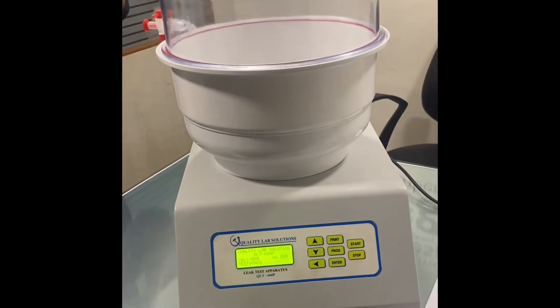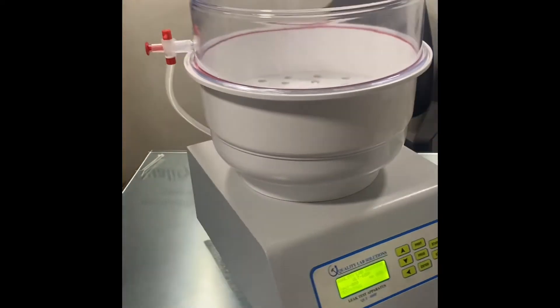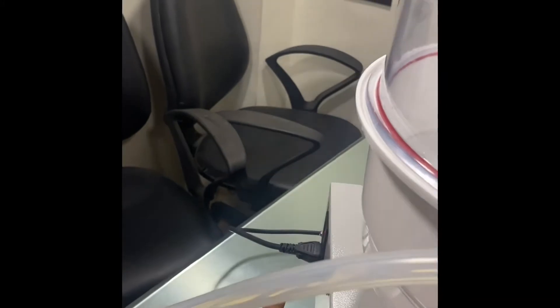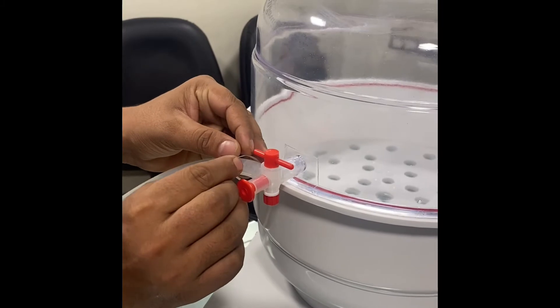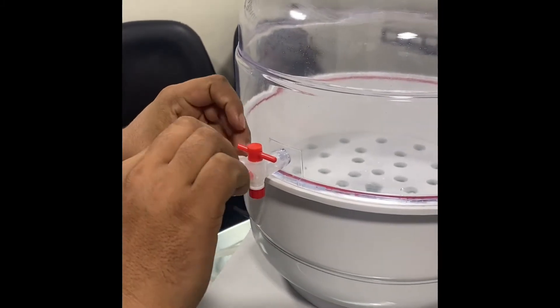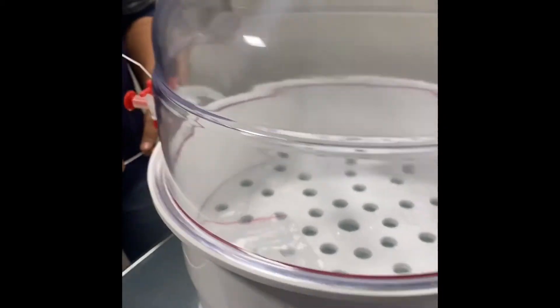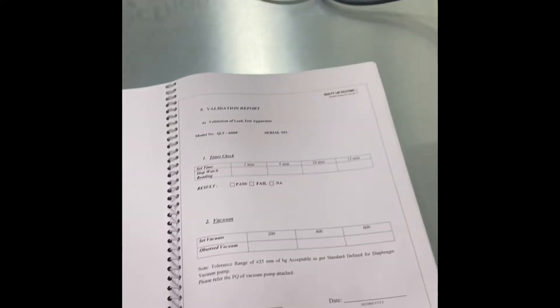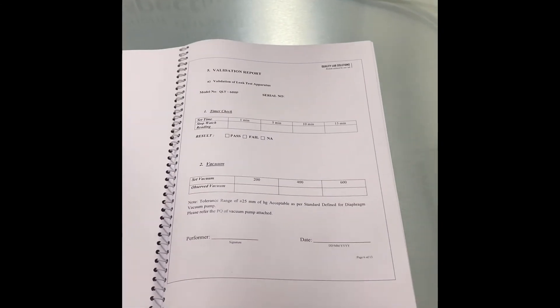Before starting operations, we will make sure some pre-requisites are ticked. We will do a pre-check to make sure that there is no leakage at this point and at this point. This is how we ensure there is no vacuum leakage, because even the slightest leakage will cause the vacuum range to fall outside the range specified in the operational manual.